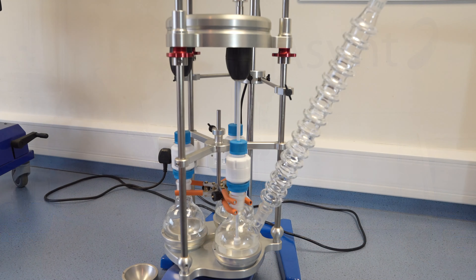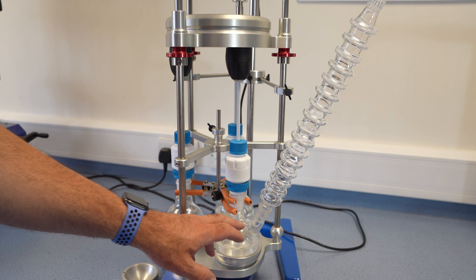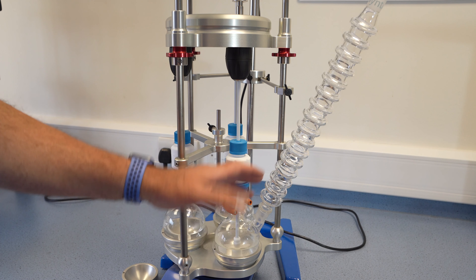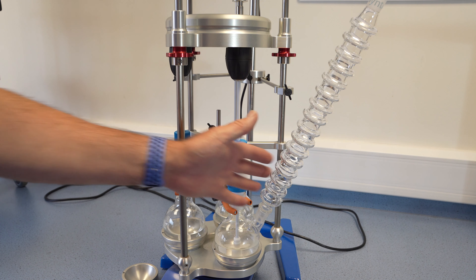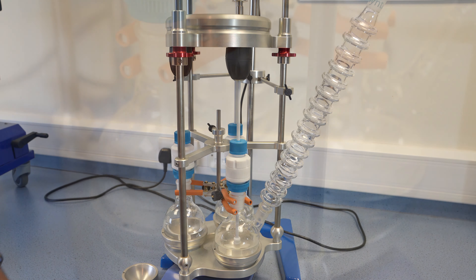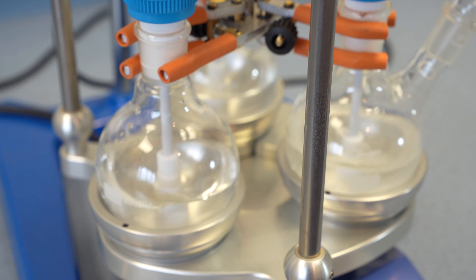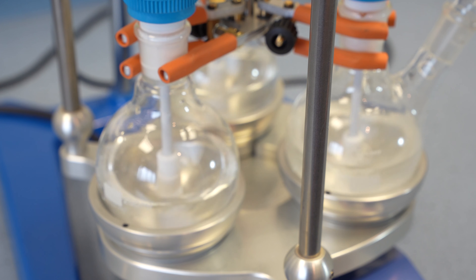Using a two-neck or potentially three-neck flask, you can easily mount a condenser at an angle in Vortex. The stirrers give excellent mixing performance, and they're designed to fold so they fit through a standard glass socket.